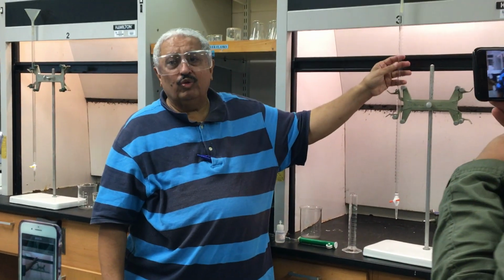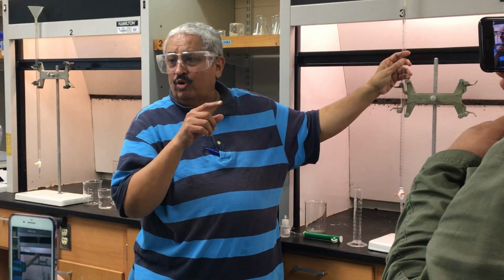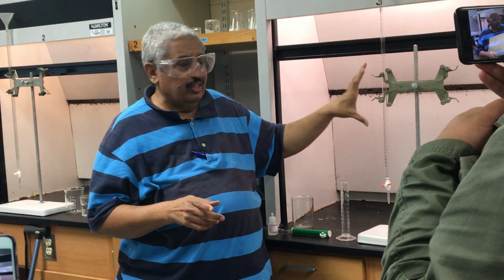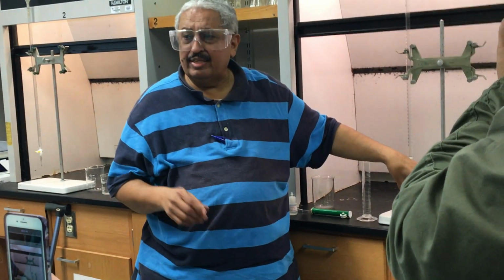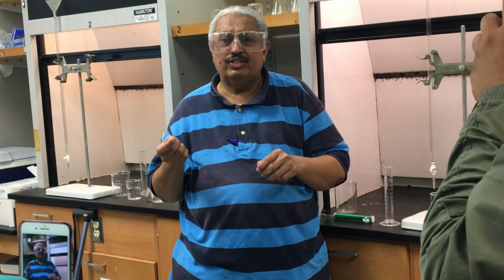Sodium hydroxide will be my known concentration. The bottle says 0.1302 molar. I know the concentration of this, but I don't know the concentration of the vinegar. So titration is a method used to determine the concentration of an unknown acid or base.